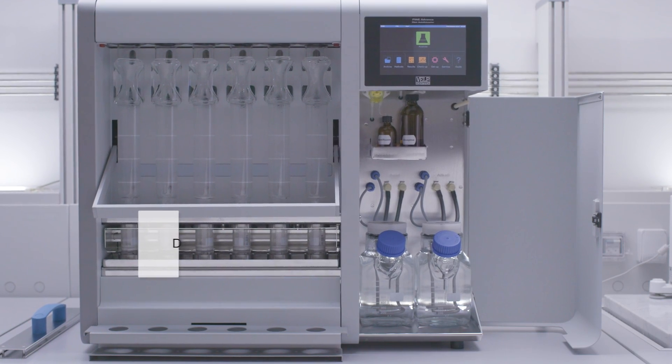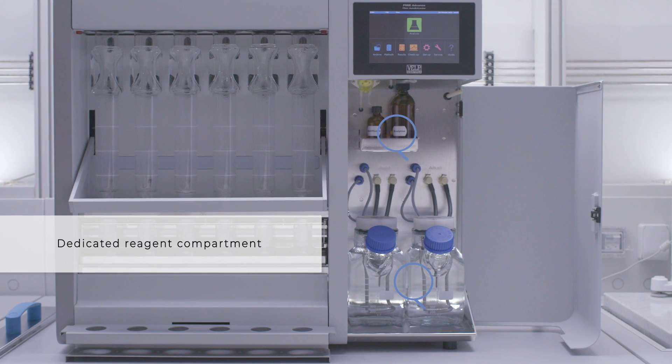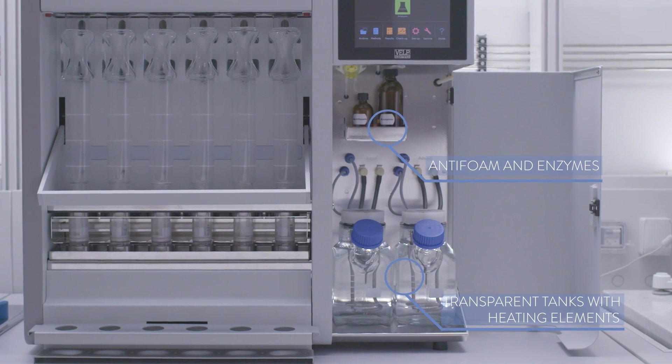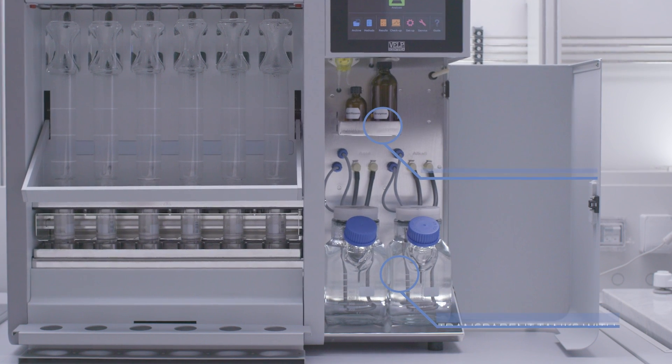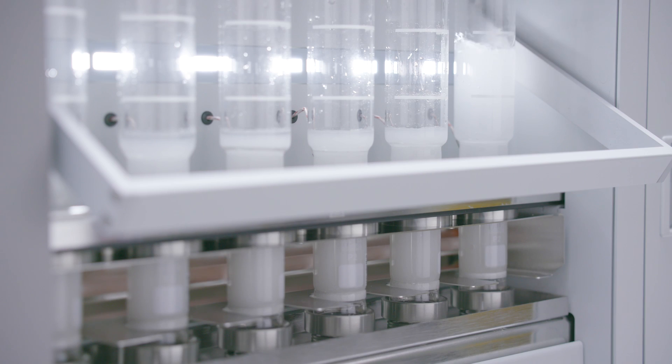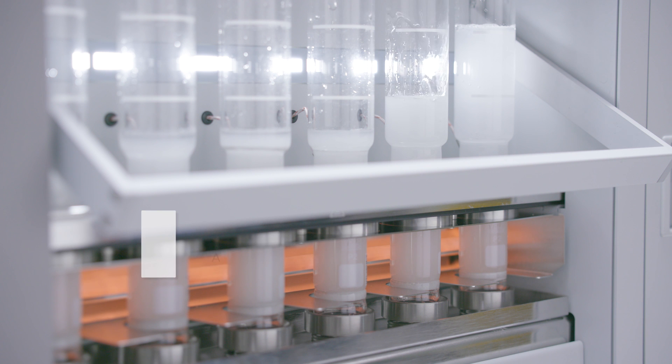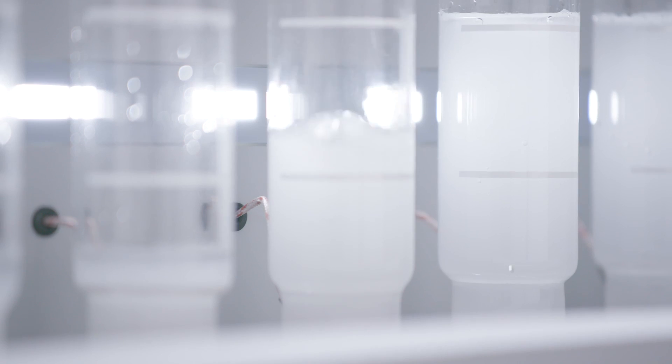The Feeway Advance offers a dedicated reagent compartment where tanks and bottles containing all necessary reagents, including antifoam and enzymes, are stored. The tanks are equipped with heating elements and sensors to preheat and dose the reagents automatically without any risk of contact with hot fumes.